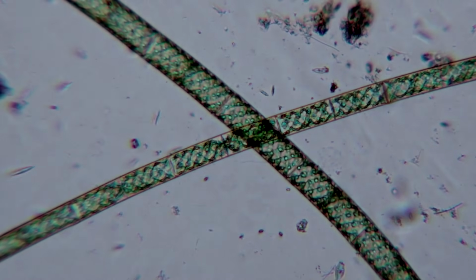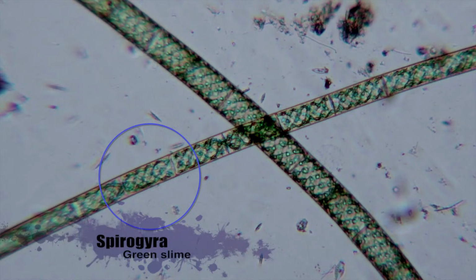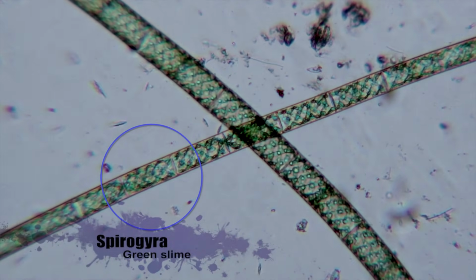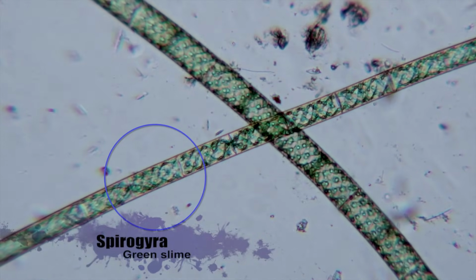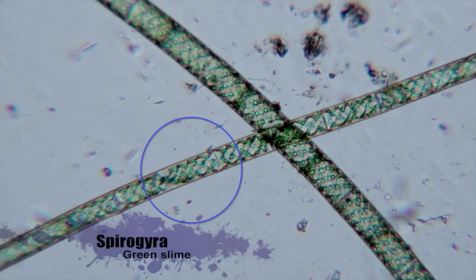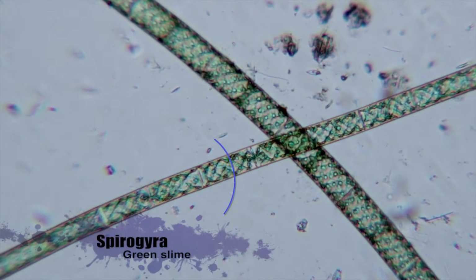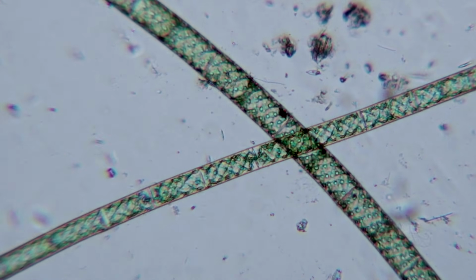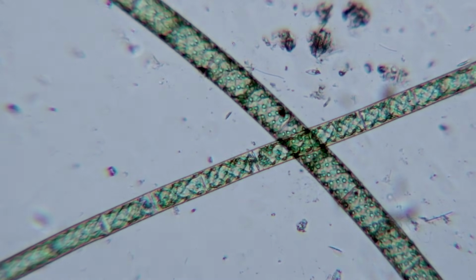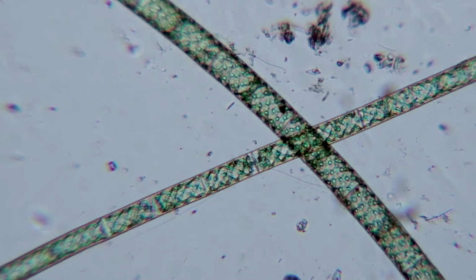This is another form of algae, Spirogyra. This is a multicellular algae whose individual cells attach together to form long strands. The outer surface of these cells is covered in pectin, which is similar to what you might find in your typical supermarket jams. This mixes with the water and makes Spirogyra slimy to the touch. And in large enough quantities, you get natural green slime.